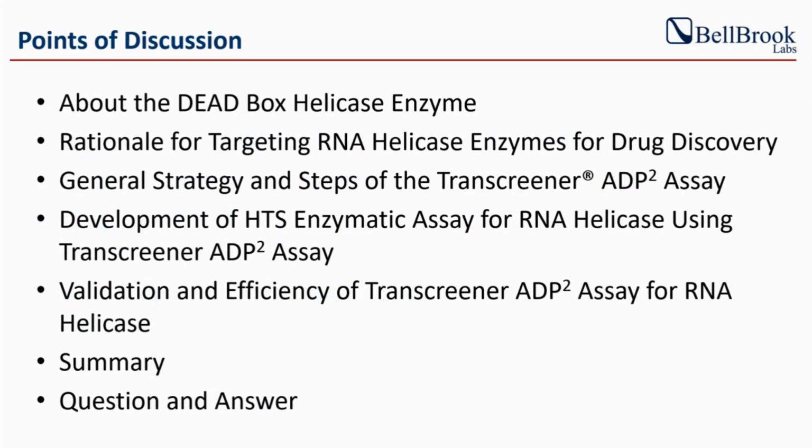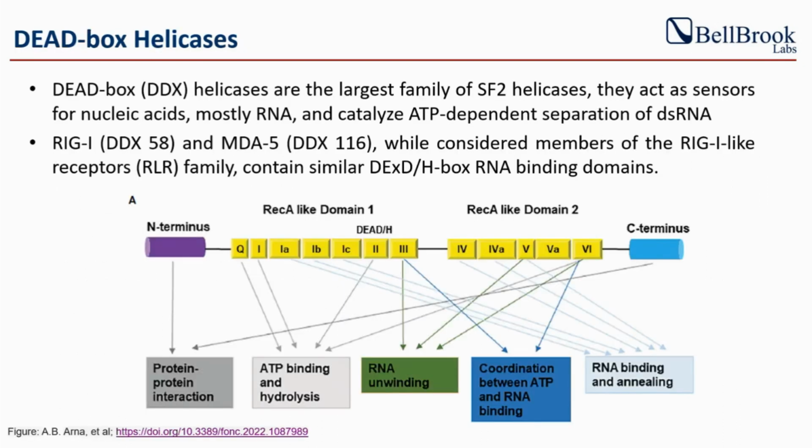Before going to our discussion, here I would like to show you our points of discussion today. The presentation will be around 20 minutes, and after that I will be happy to answer all of your questions. First, briefly, I will talk about what the DDX helicase or RNA helicase enzyme is, and why this is important for drug discovery. Then I will talk a little bit about the general strategy and steps of the Transcreener assay, how we developed this RNA helicase enzyme assay, and what the validation and efficiency of this Transcreener ADP assay are. Then I will summarize, and after that I will be happy to answer your questions.